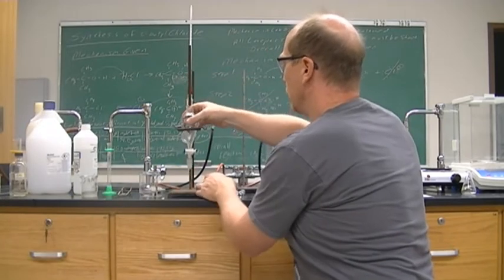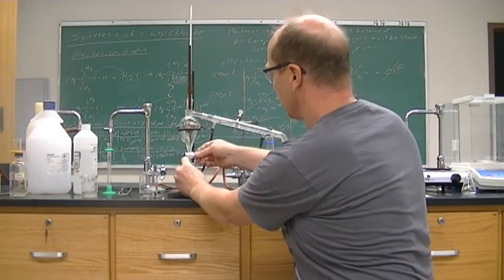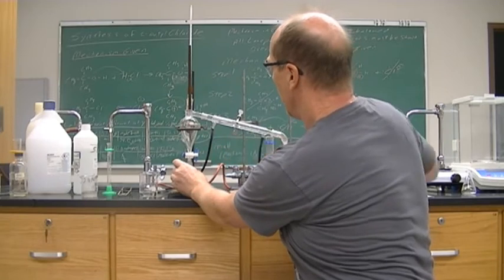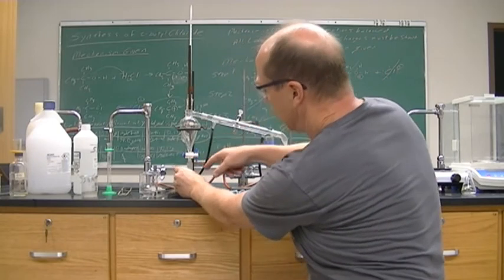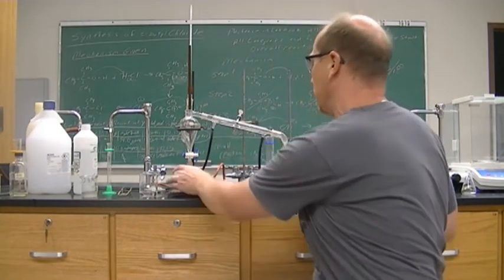So when it says to dry this liquid, we're not waiting for it to evaporate. We are just putting it on, so any liquid that's water in here would have mixed with our product. Even if we went out the top, we would have had some issues.